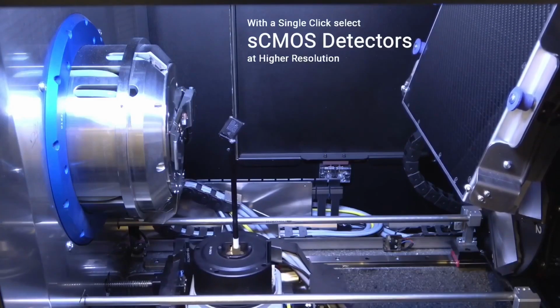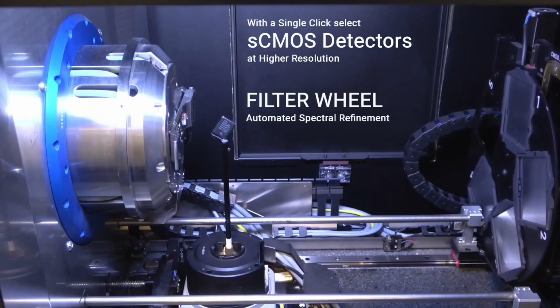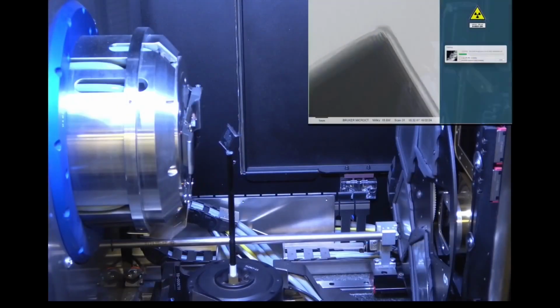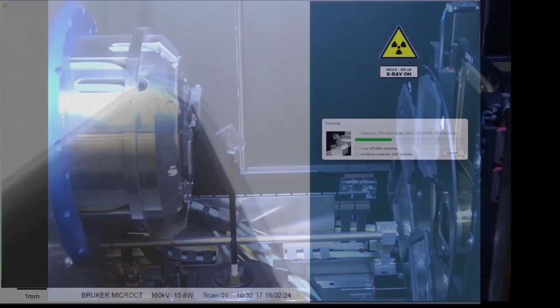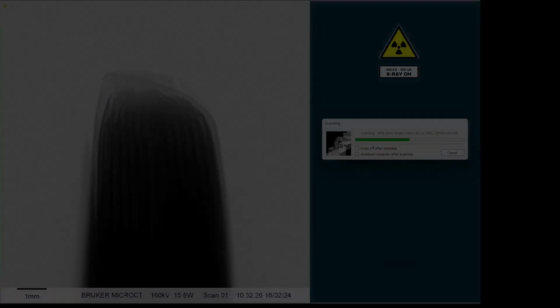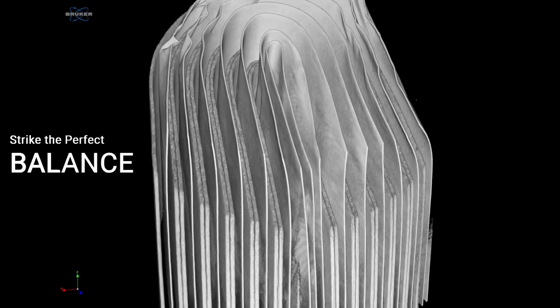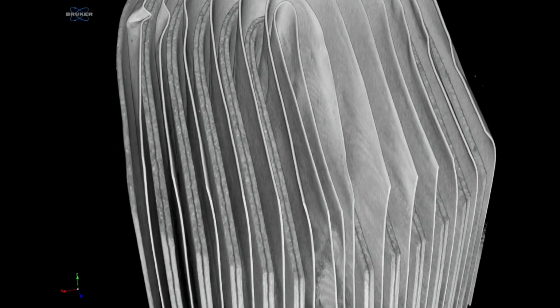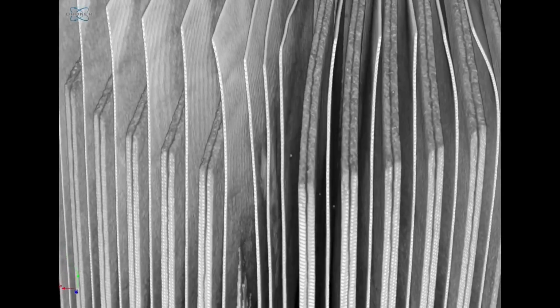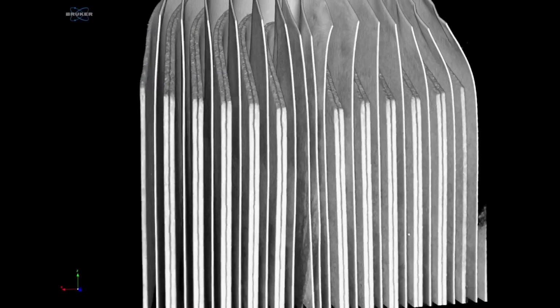So now we're switching to another detector, just a single click of a button in the software. We move the sample a little bit closer to enhance the magnification, so to have a better resolution. And then we're collecting 2D projection images again and get a very nice view of the structure, where you see the individual cathode layers already, but also very nicely the longer anode foils. You see some of them are a little bit more tilted. And here you could then do, for example, a detailed analysis of the anode overhang.